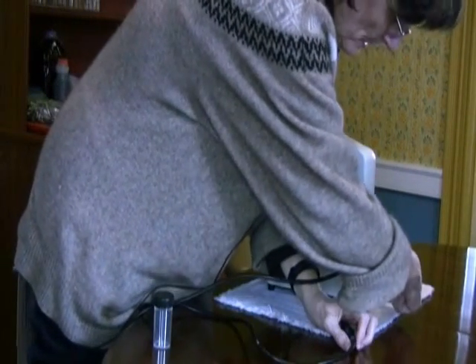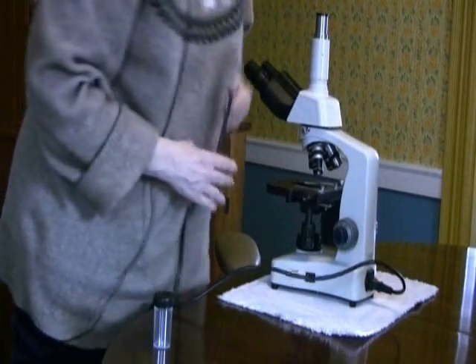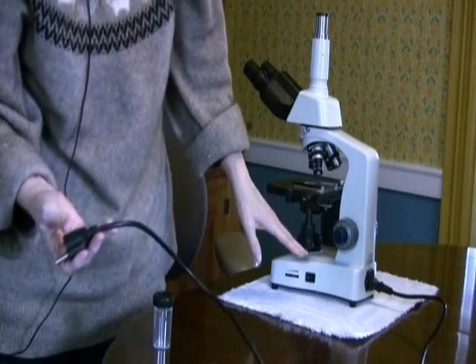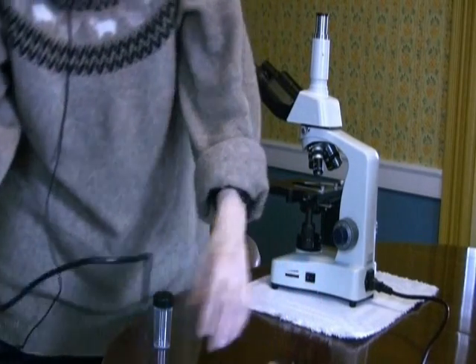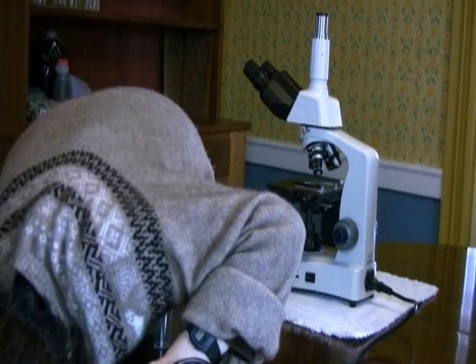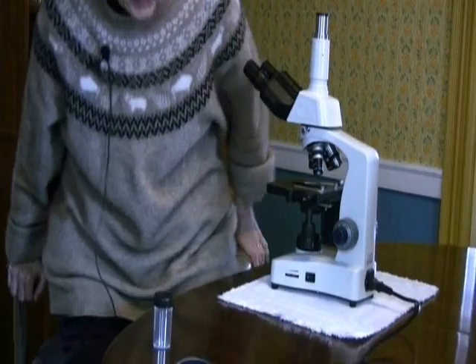and make sure that you have a surge protector that you're going to plug into, because you don't want to be blowing the light in your microscope constantly. So plug this into a surge protector so you don't keep blowing the lamp. And we're all ready to start.